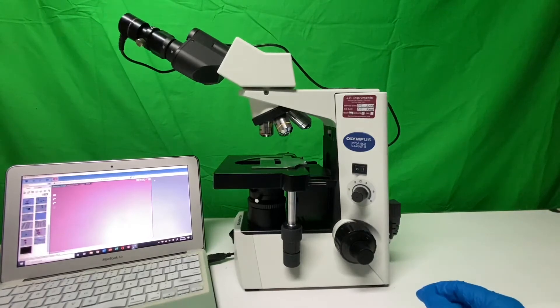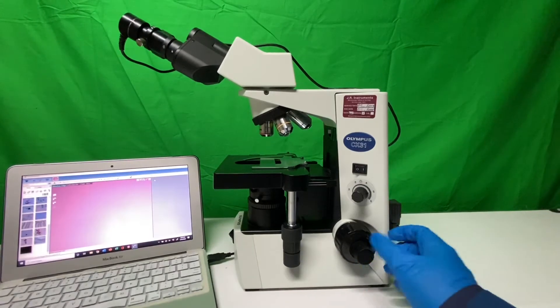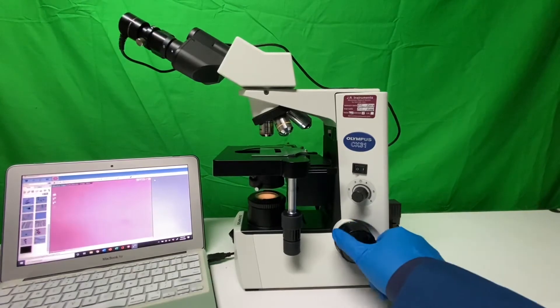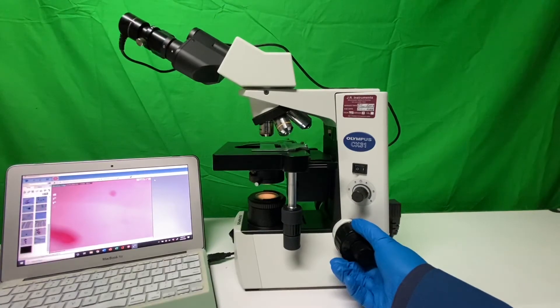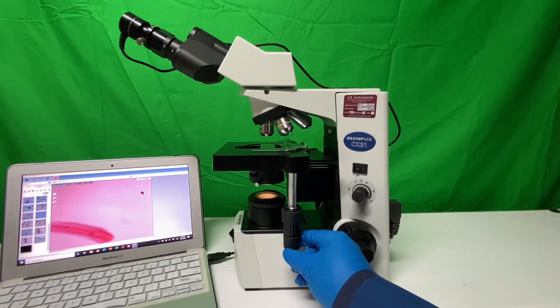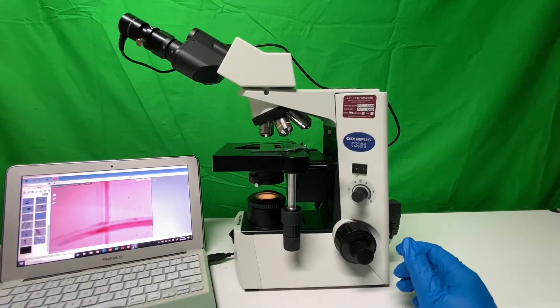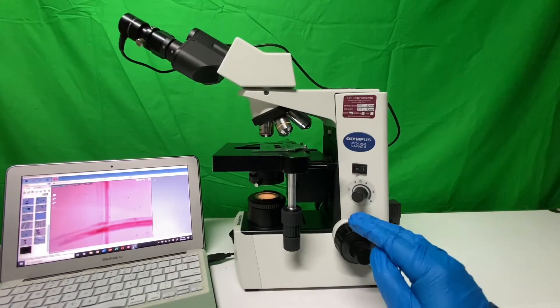Now we want to learn how to focus. The easiest trick is to take the entire stage all the way up only under the scanning objective, and then gently do about an eighth of a turn down. You'll notice how we usually find the image that way. We can see the original drawing — that's all it takes to find it under the 4x or scanning objective. Raise the stage all the way up and give it just a little bit of a turn down.